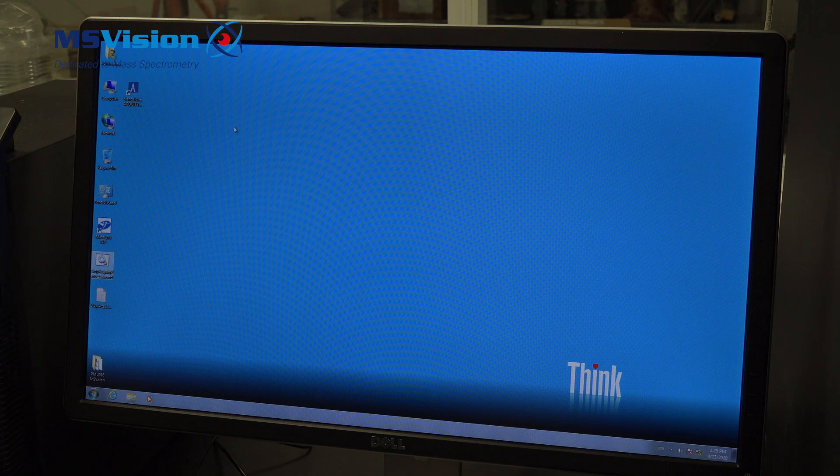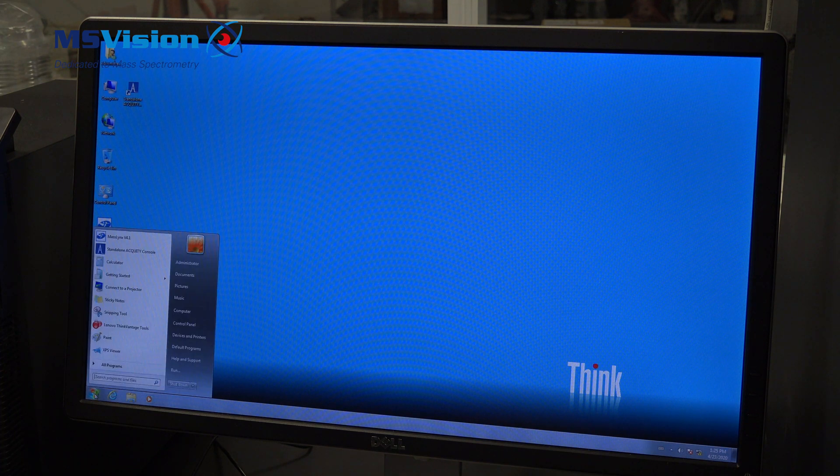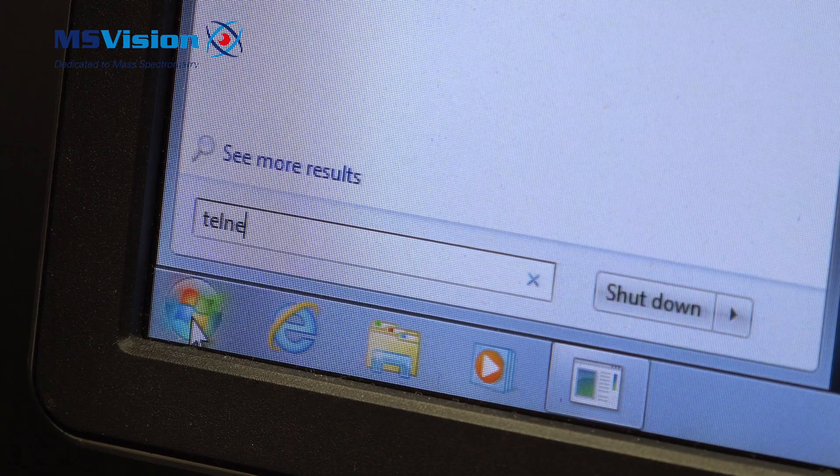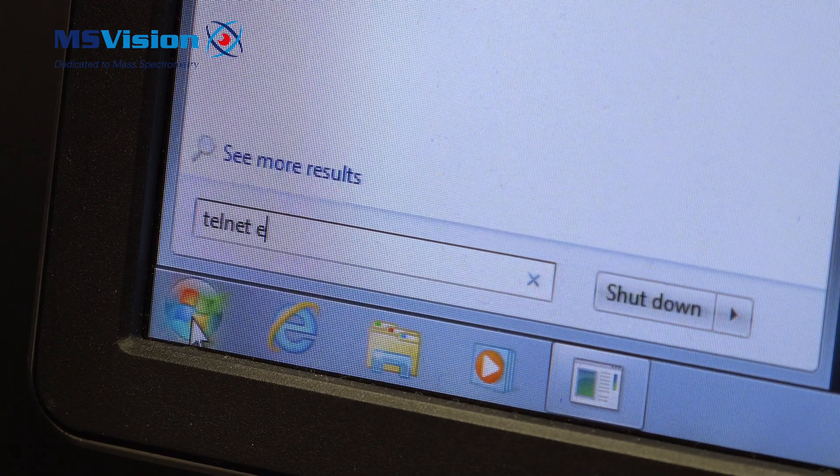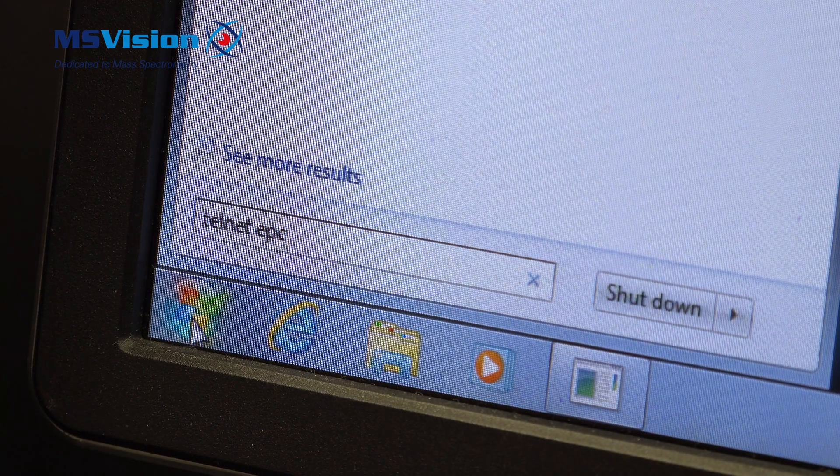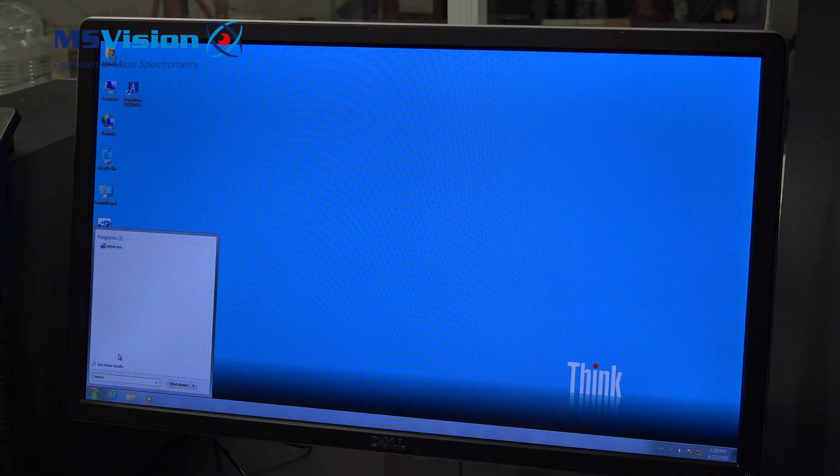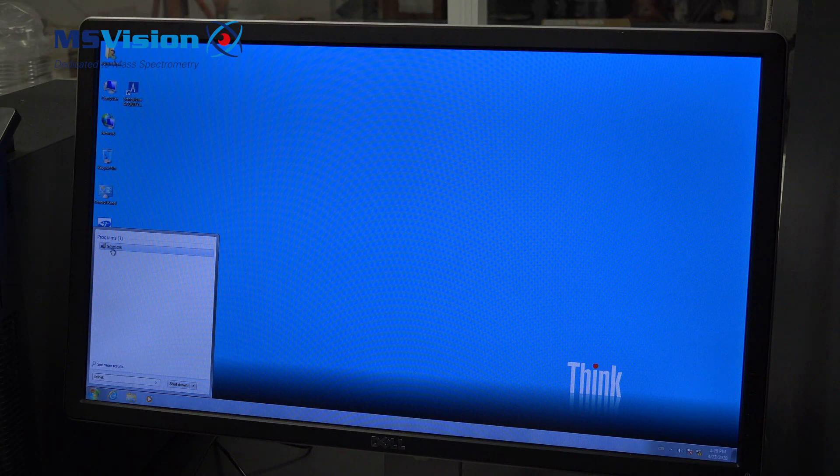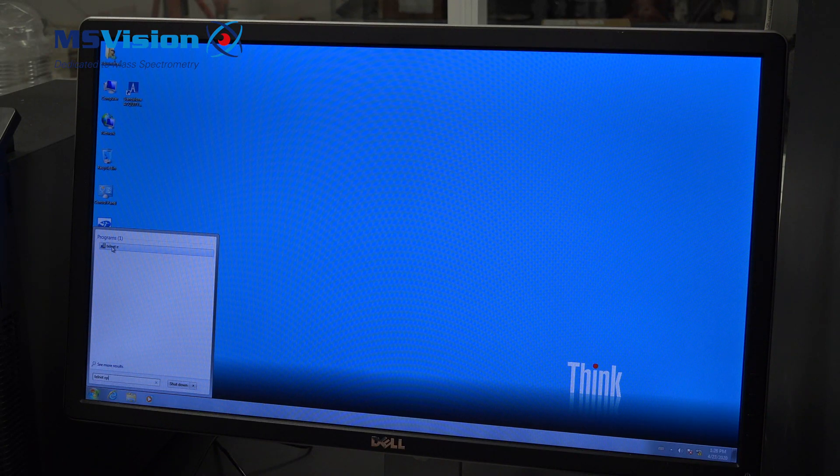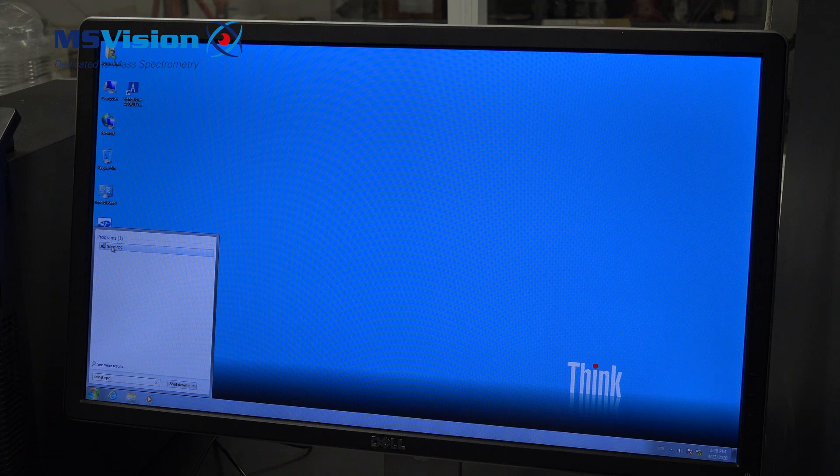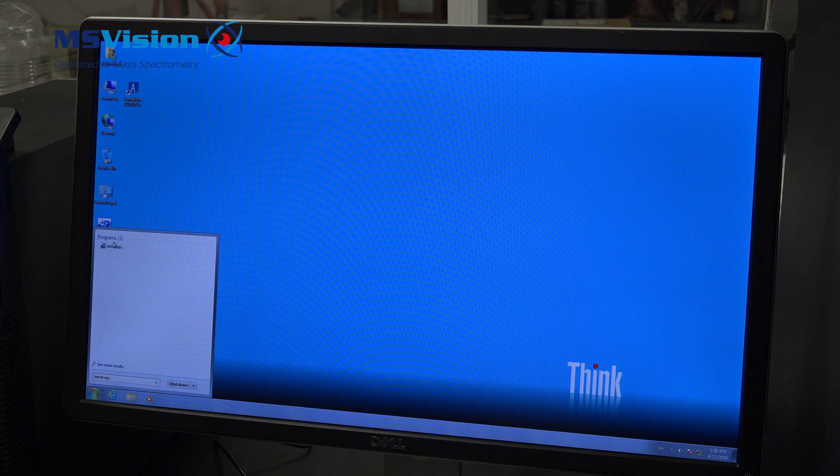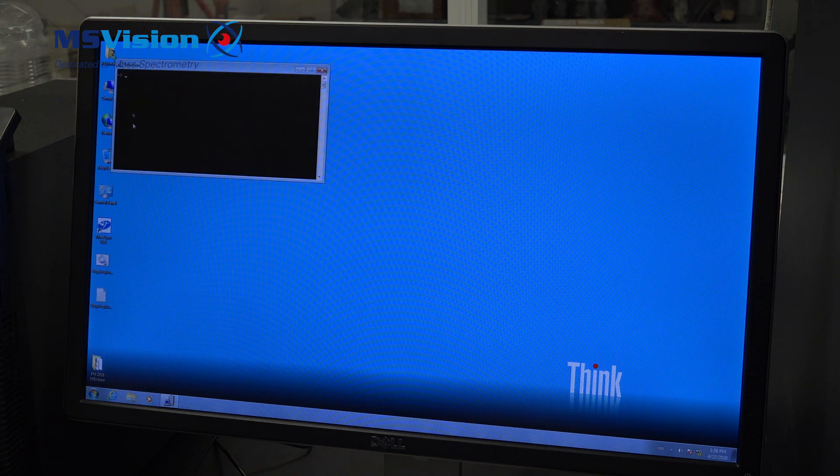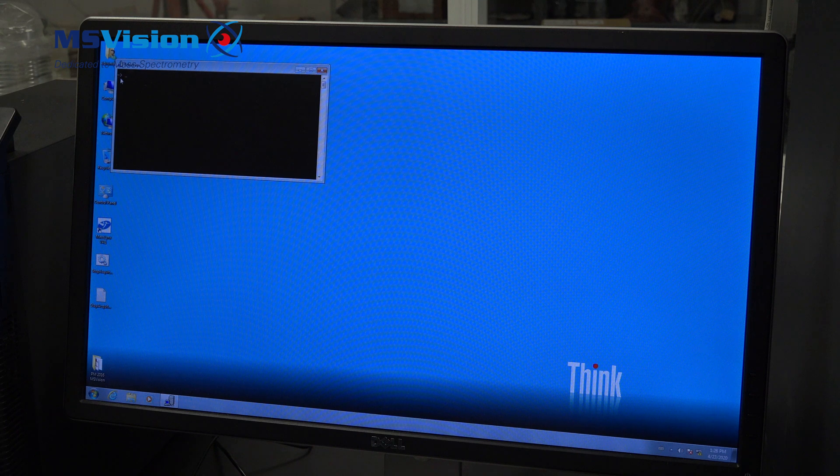To reboot the system, type telnet EPC. EPC standing for embedded PC. You will see an arrow with a blinking cursor. Type reboot and press enter. Now the system is starting to reboot. You do not see that here, but we can see that or follow that with another command window.